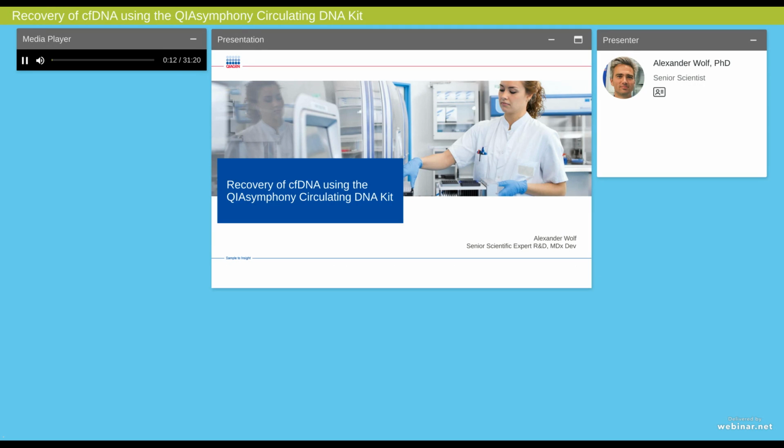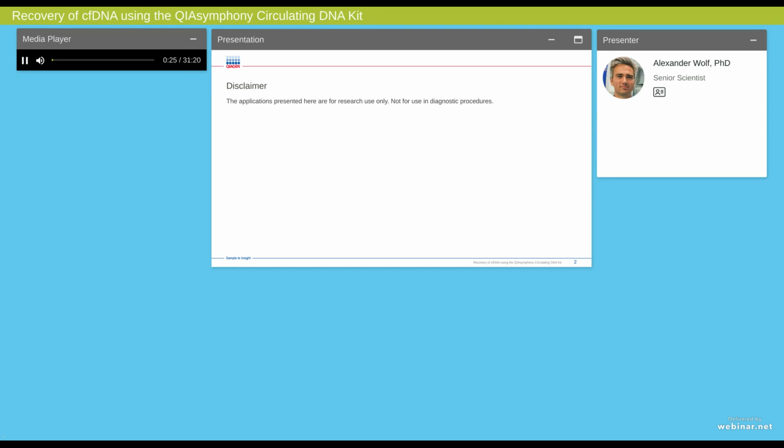My name is Alexander Wolf and I'm the technical lead for the liquid biopsy portfolio in molecular diagnostics at QIAGEN. And I would like to give you a general overview about this fascinating and very interesting topic of liquid biopsy, and will also focus on some data from the fully automated purification of cell-free DNA using the QIAsymphony instrument.